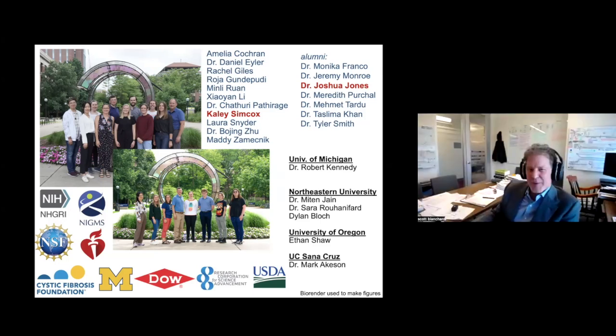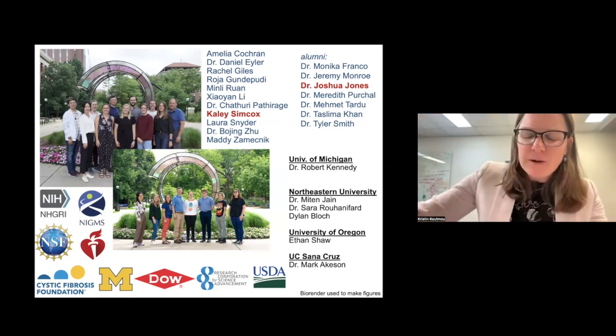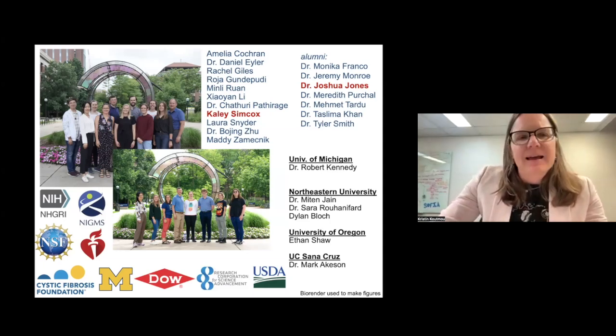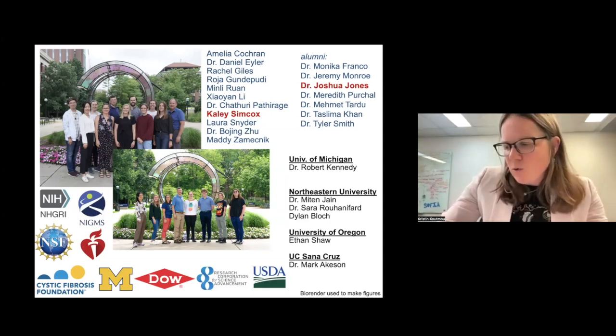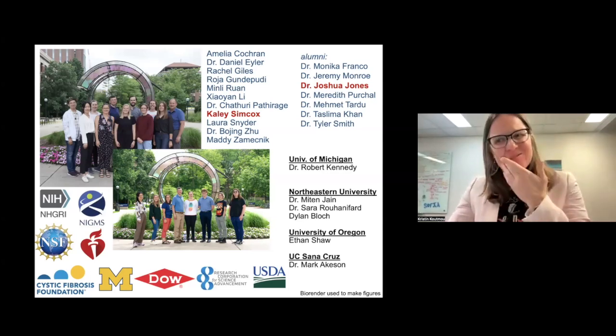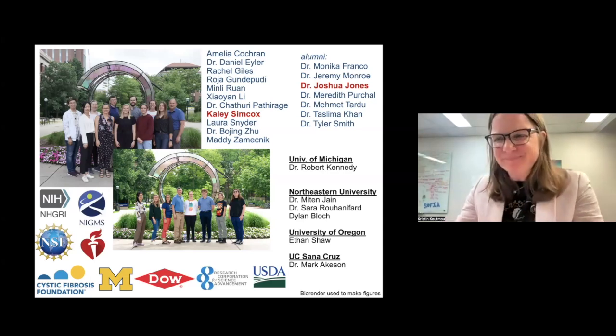Okay, we got a lot of questions appearing, so I gotta keep going. Do you think that other fragmentation techniques, such as EPD, would give you better identification by decongesting the MS-MS spectra? Possibly. But our issue has been less with the MS-MS spectra and more with getting things that are long enough to fly well enough that you get enough depth to be able to say anything. Great.